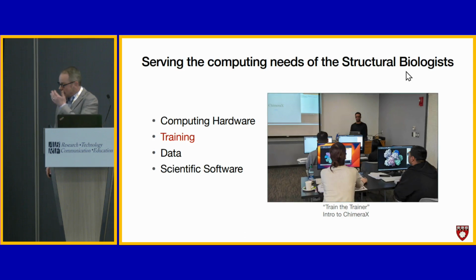We also do training, so we have workshops. This is one we did a couple of weeks ago. We call it the Train the Trainer workshop, where we're bringing in PIs from all over, and we're training them on certain structural biology tools with the expectation that they will take those materials and what they learn back to their lab and train their staff.